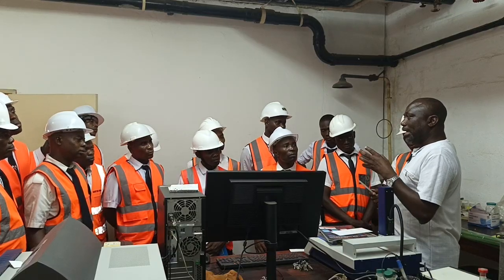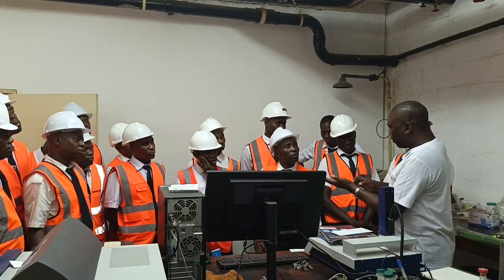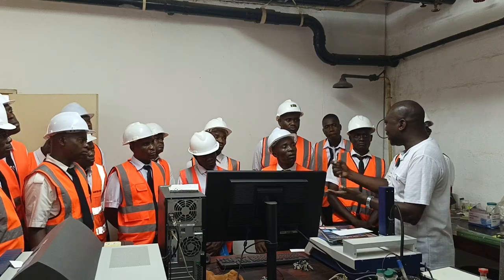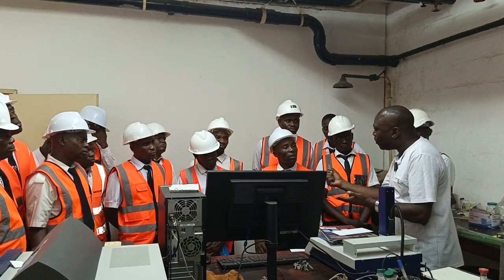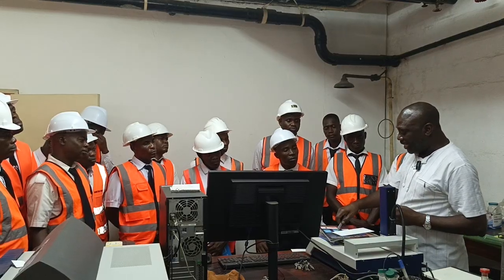And if, for example, I just remove that very small powder and put it into a test tube or a beaker, and maybe the swab came from the door where you suspected that the person who could have ignited the fire obviously opened the door, and then you swab that part, you bring it, we analyze it like this.